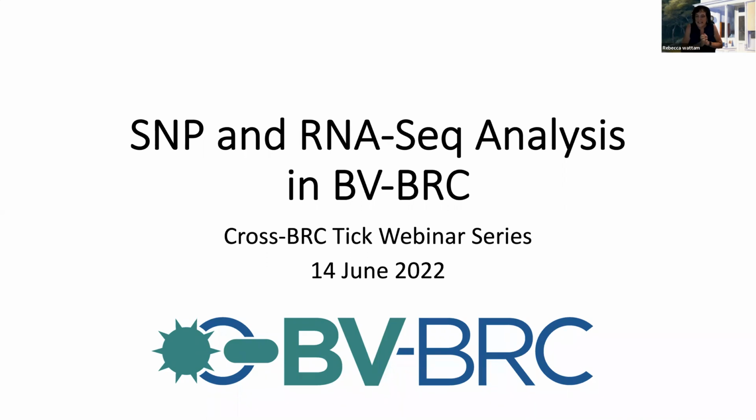I'm Rebecca Wadham, and this is the last, I believe, in the Cross BRC Tick webinar series. Today, we're going to discuss SNP and RNA-Seq analysis that you could do in the Bacterial and Viral Bioinformatics Resource Center, which we call BV-BRC. BV-BRC is a recent combination of the bacterial BRC, known as Patrick, and the two viral BRCs, which are IRD and Viper.